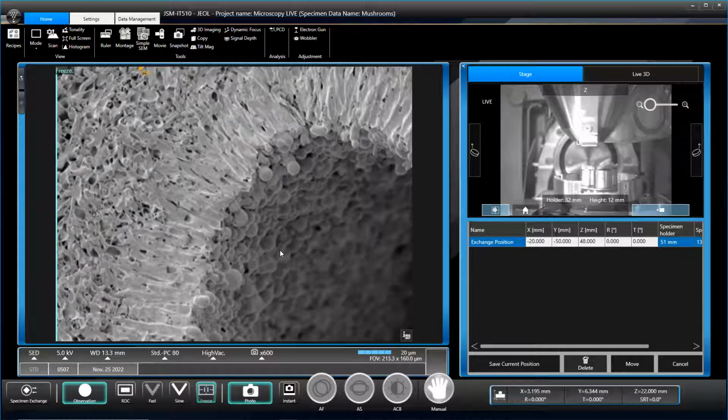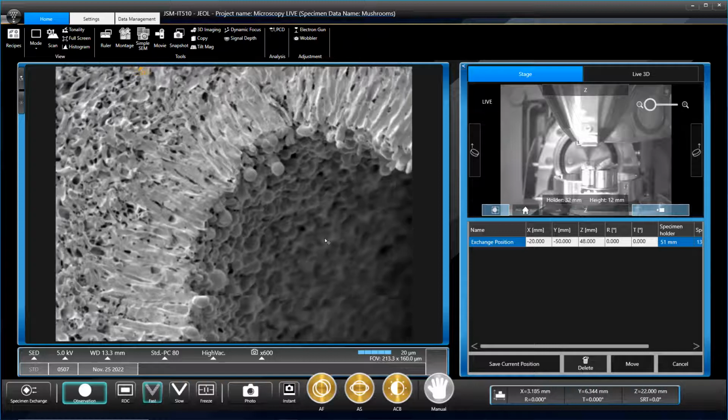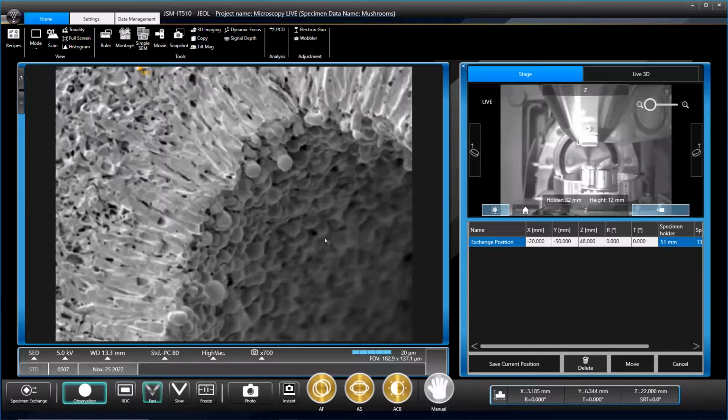We've got gold coated samples hanging on our Christmas tree at the moment, like leaves and stuff. The Fungus Christmas MicroscopyLIVE we did last year. So I've got some gold coated cloves, gold coated orange peel, a full little mulling spice set. So that's all live again. You can drive around somewhere else, using the mouse or joystick, entirely up to you. If you zoom out, it'll just move faster.